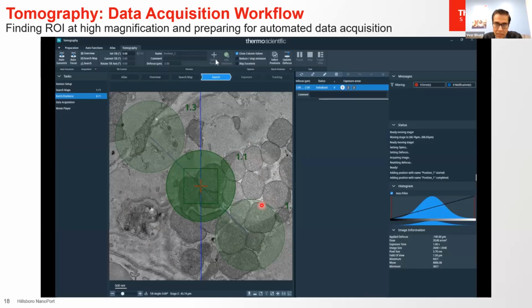So if we are talking throughput, then it increases throughput dramatically. And then, of course, once we are set up with this region of interest, we can go back to Atlas and the overview images that we acquired earlier, find another region of interest, and we can queue that up here. In this example, I only have one line populated, but here we could have any number of, like 20, 30, 40 sets of these kind of acquisitions queued up. Okay.